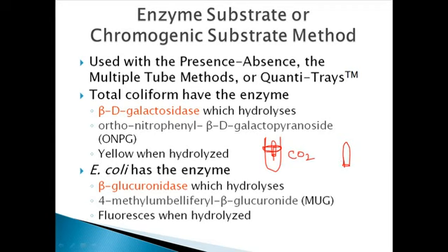If you look at the Durham's tube, you can find some air, which is carbon dioxide, stored in the Durham's tube. In many cases it is small, in many cases larger, or in some Durham's tubes it may not be stored. So from the production of carbon dioxide, we can say that the water is contaminated with coliforms, not actually fecal coliforms.